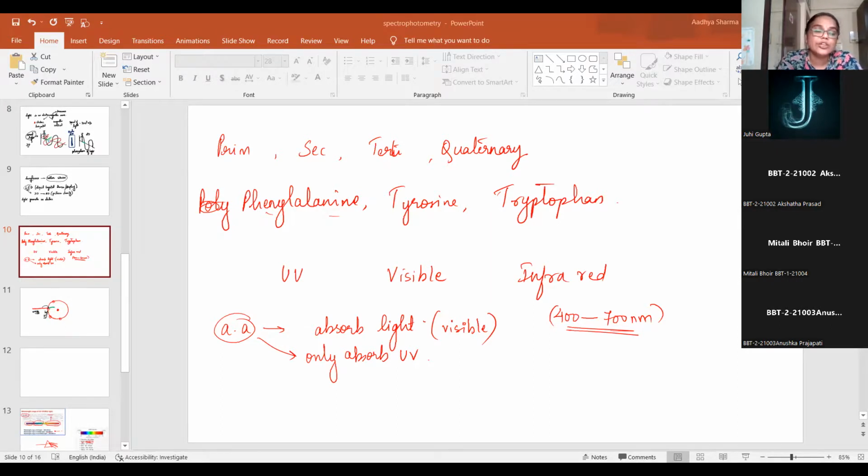So that is what basically you are trying to use to know the structure. Okay, so that's why I told you that, and also know the structure and know the concentration of the structure. So NMR basically works on the structure elucidation. When we talk about spectroscopy, we are talking about quantity also, we are talking about concentration also. So that is one of the applications.